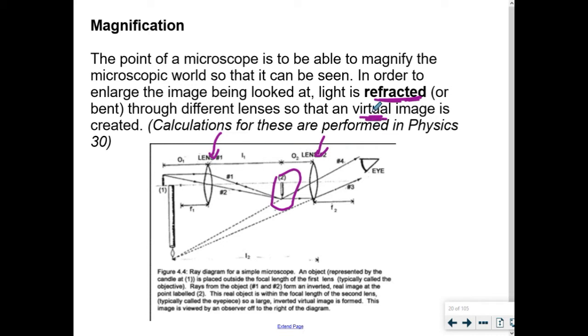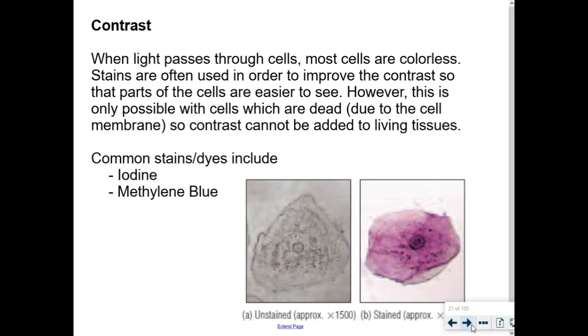Are you actually seeing the cell? No, you're seeing an image of the cell. Okay. That's magnification. Most kids don't struggle with that. By the way, before I move on to resolution, I want to talk about contrast for a second.